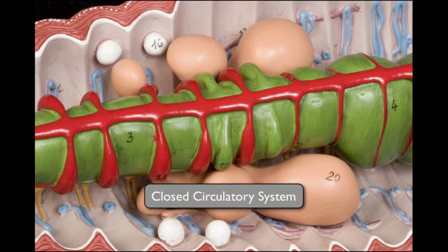Now is probably a good time to point out that earthworms have a closed circulatory system. This means that the circulatory fluid, which we can call blood, remains within vessels at all times. Some animals, notably insects, have an open circulatory system, in which the circulatory fluid is sometimes within vessels, but also travels through the spaces surrounding the internal organs.